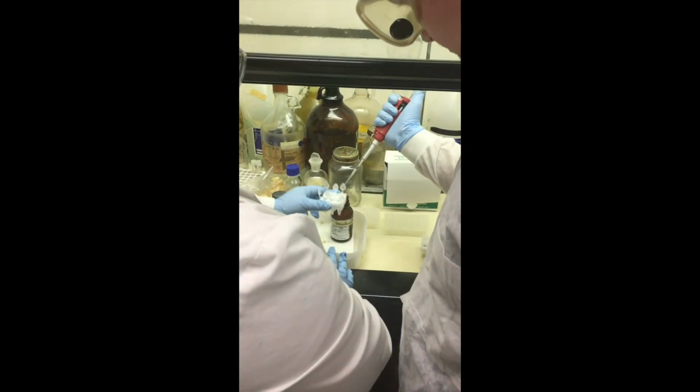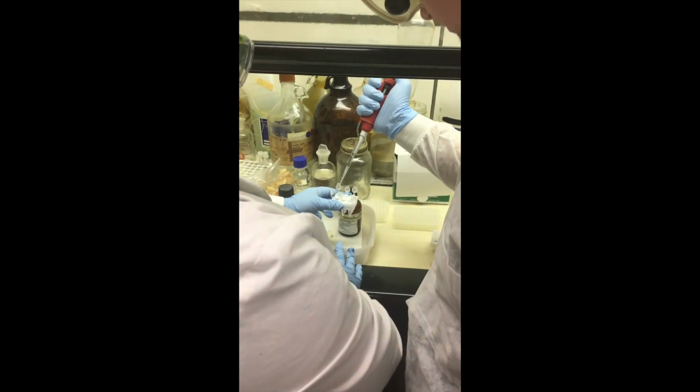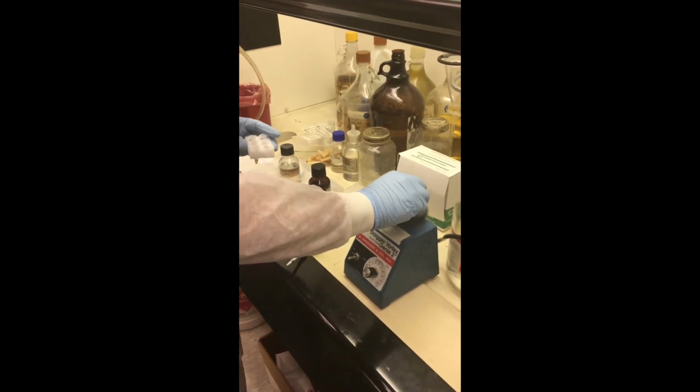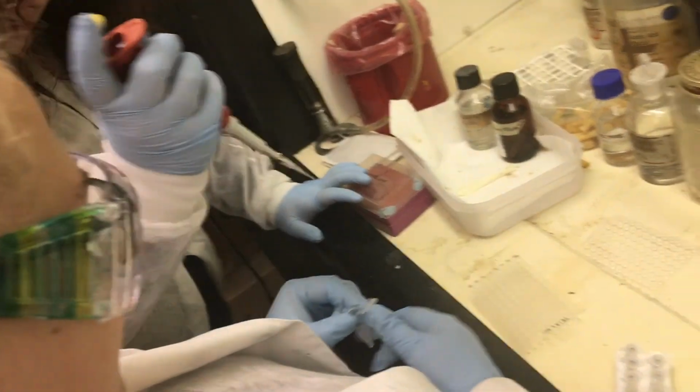Following the procedure laid out by Chang and fellow researchers, we added 100 microliters of chloroform and methanol mixture to the dry pellets. We then vortexed the tubes to ensure that the cells were blended within the mixture. We centrifuged the tubes to remove all cell components except the lipids. We moved 50 microliters of the mixture to microtiter plates.